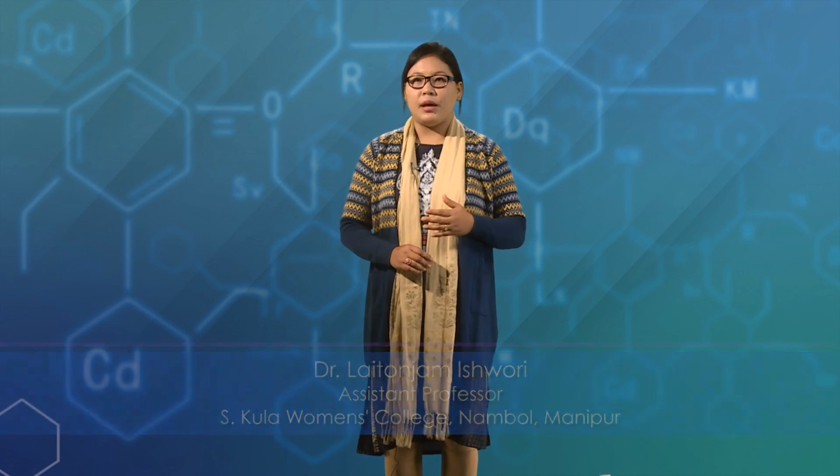So that was all about microscopes, and in the end I'll sum up by stating that the tools of microscopy and molecular visualization have shaped the current understanding of microbial cells, of how they grow and divide, organize their DNA and cytoplasm, and interact with other cells.